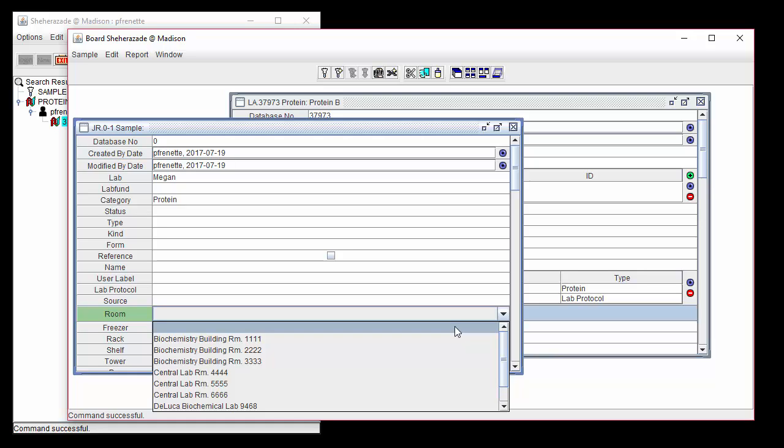In this tutorial, we will show how these drop-down lists can be customized by labs through lab resources. We will walk through options in Room and Status resources. The choices in the drop-down lists are defined by the lab master or by a lab member who has been assigned the appropriate permissions through the Can Do resource. A tutorial video is also available for the Can Do resource.